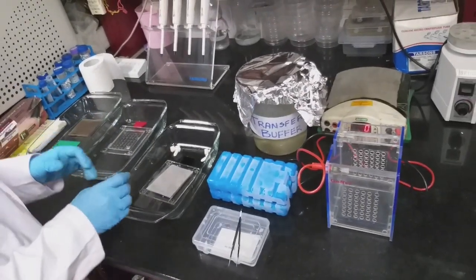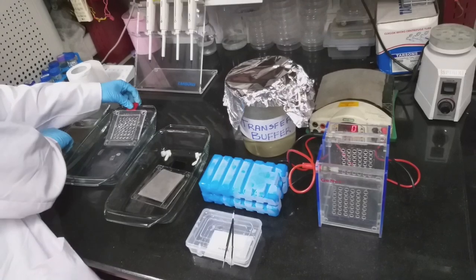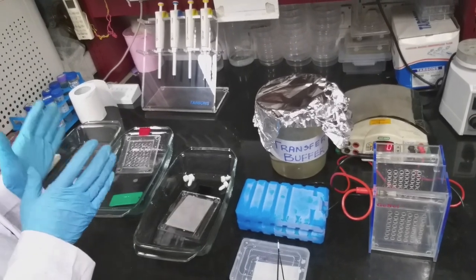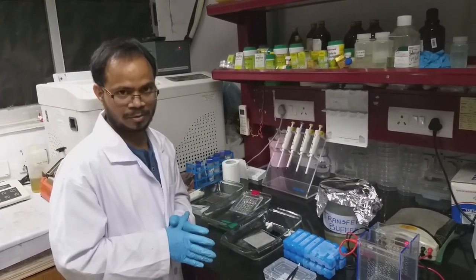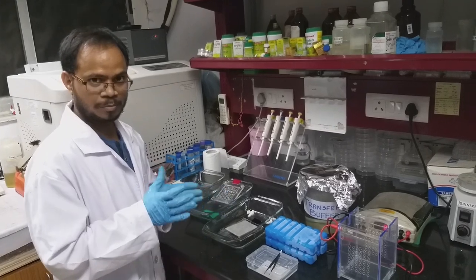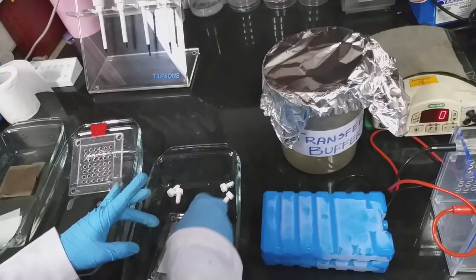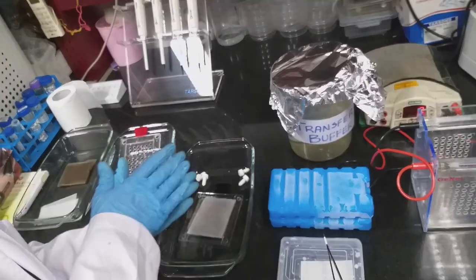Once you have inserted the blotting sheet, you have to keep your gel. Here we have to remember that the gel, after finishing the SDS-PAGE running, you have to keep in transfer buffer, so that it will give identical condition or equilibration during transfer, so that protein transfer may be easy. So this is the gel, keeping on the negative side. After that, we have to overlay with the membrane.